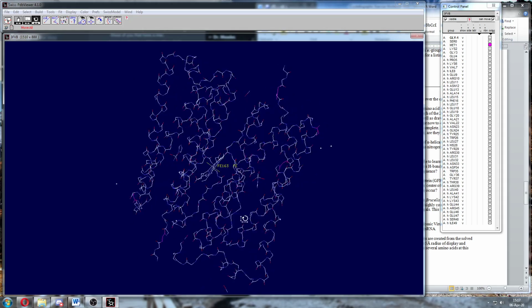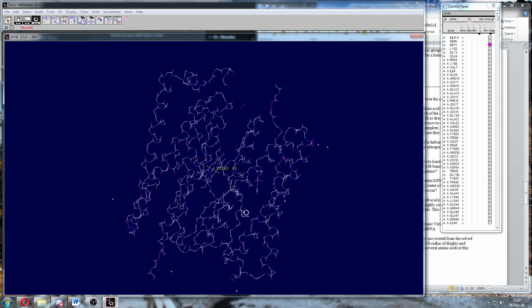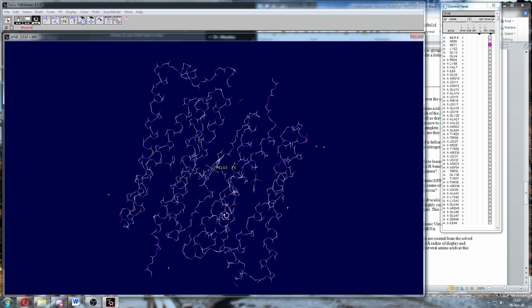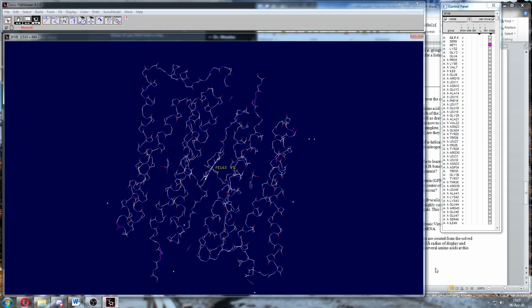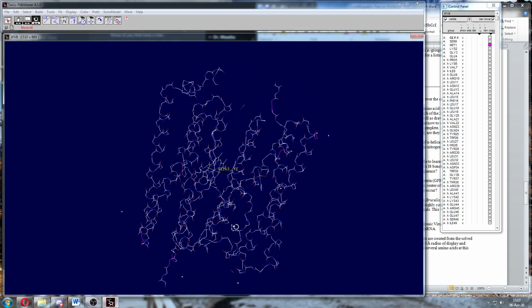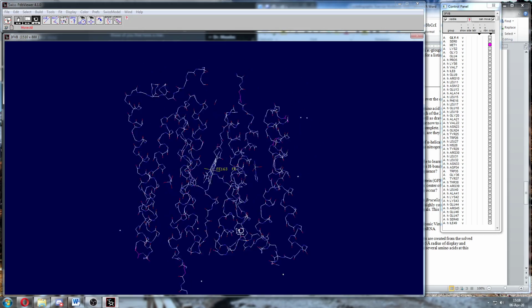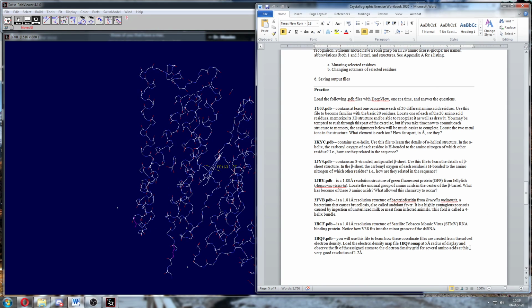So the idea here is the bacteria need an iron source, and they're not getting it without this molecule. So they're stealing it from you. So if you can inhibit this thing in some way, it could be an antibiotic. Problem is, you have molecules like this on your own, like hemoglobin, and you'd like to not inhibit that one binding oxygen. That would be bad.